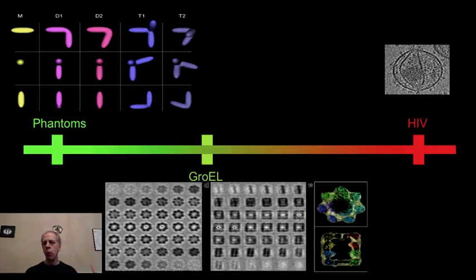So what you do in most image processing, but in particular when you're talking about medical imaging, is you go slow. First, you start from what are called phantoms. You create three-dimensional shapes that look like viruses from your prior knowledge. You add noise, you project them, you make missing wedges, so you make them like they were acquired in the microscope.